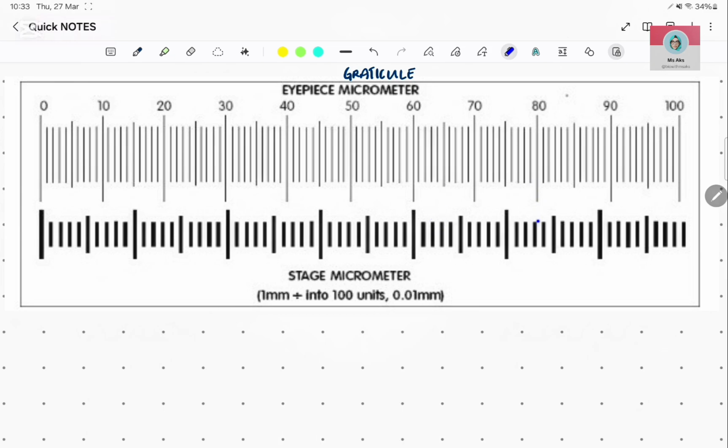This one is not quite. Notice, look at the left side of the line. So that's not aligned well. Let's see this one. This one could be used as well. Yep. The further it is, the better.